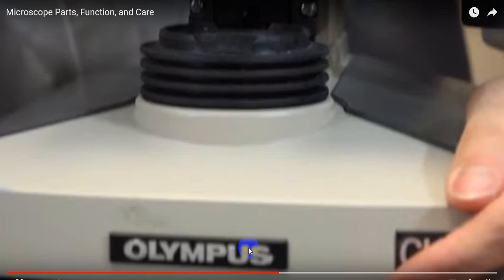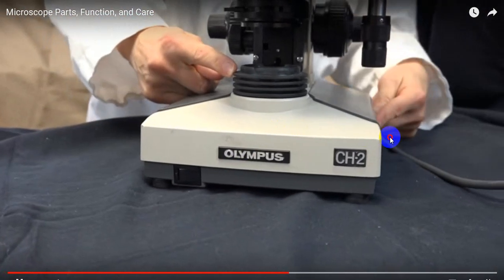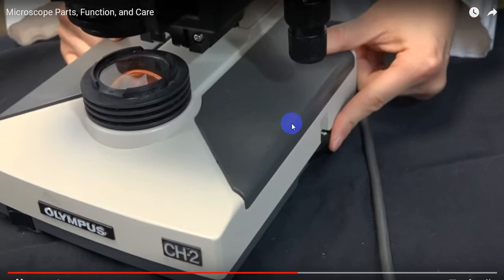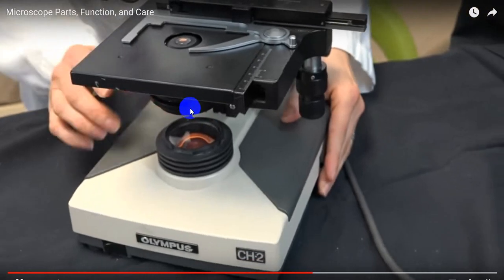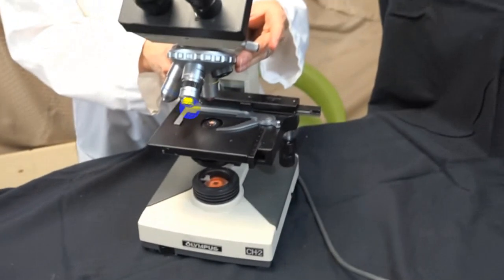On the front of your microscope, there is a switch. This is the on and off switch. Turn on the light source. On the side of the microscope, there is a dial where you can regulate the intensity of the light. Turning the dial up increases the brightness of the light source. When you use your microscope, it's best to start with the light relatively low, and you want to start with the lowest power objective in place.